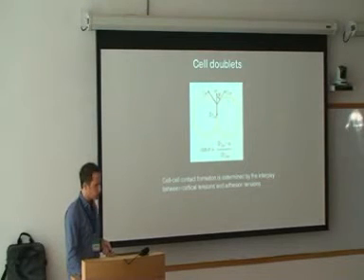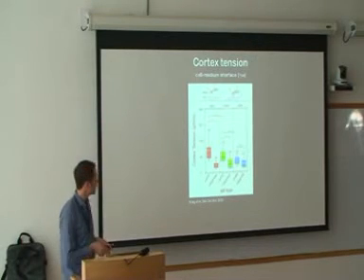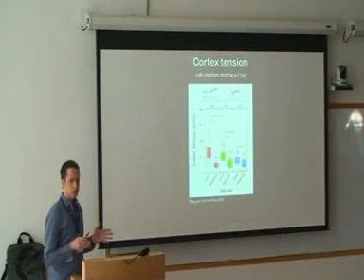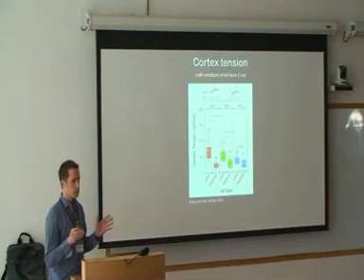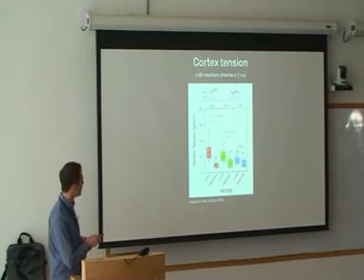Now, how can we learn something about these different tensions? The way is another method, which I very shortly introduce here. What we did is, we want to measure these cortical tensions, and then via the shape of the doublet and the measured cortical tensions, calculate what the adhesion tension would be, and whether the adhesion tension is the determining factor determining the shape of these doublets.